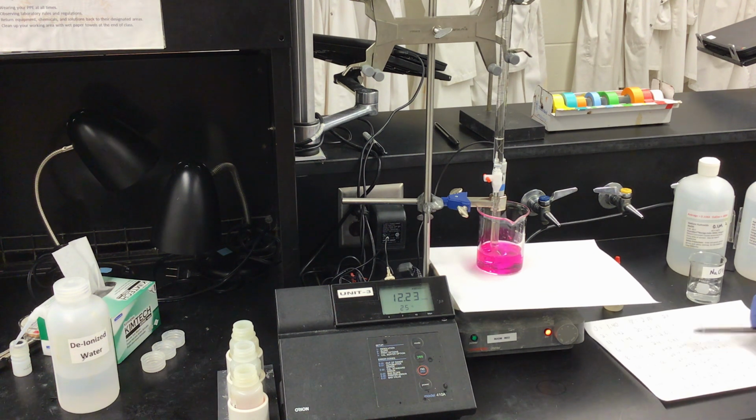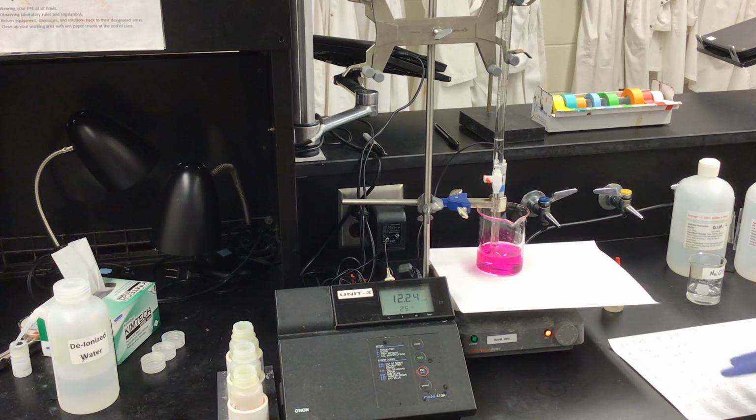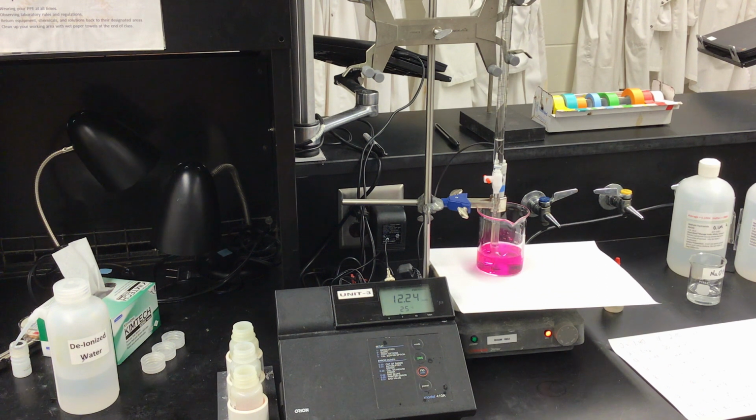So this shows as we add more base to the solution past the endpoint, once we start to reach the higher basicity of the solution, we no longer have a large increase in pH. It starts to slow down, which is a pattern we saw initially when we were adding base to our acid. We were increasing by small increments initially, then larger and larger as we became neutral. Now once we passed our neutral point between 7 and 8, we started to increase in basicity very rapidly in large jumps until we started to get to about 40 mils of added sodium hydroxide, where we started to slow back down into a very slow climb in our basic pH.